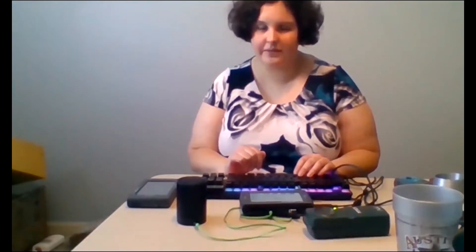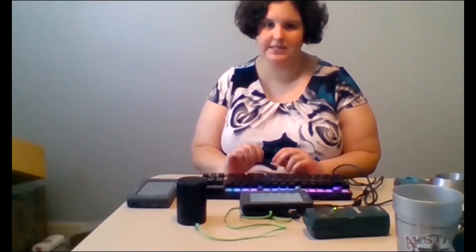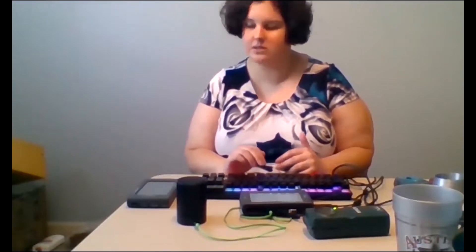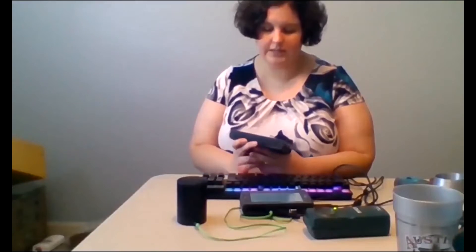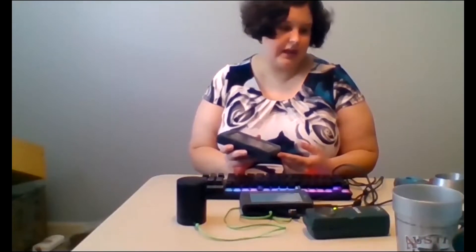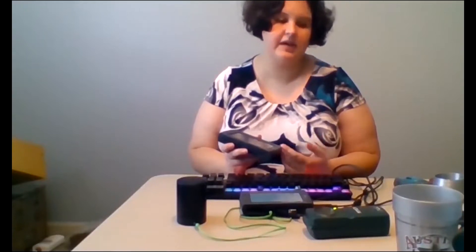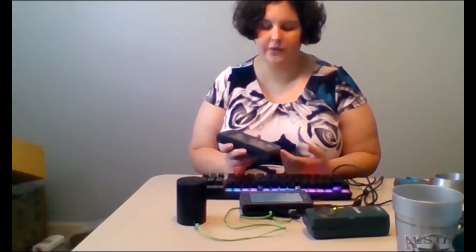Hello, everyone, and thank you for joining us today and for your interest in making science more fun and accessible for yourselves, students, or clients. For those of you not familiar with the Talking LabQuest, I'm going to give a brief overview of what the device looks like, then we're going to go over the keystrokes, and then show some different interactive activities with different sensors that you can use that might be relevant within your field.